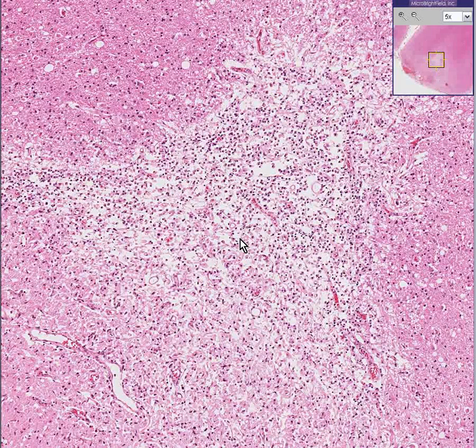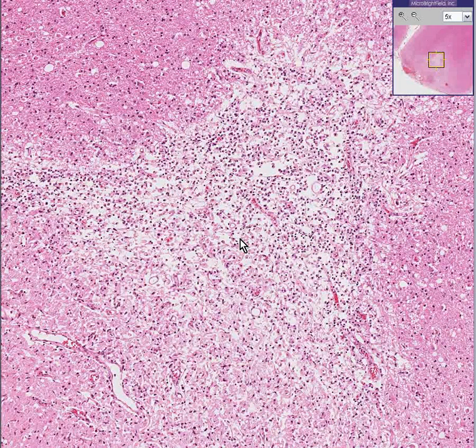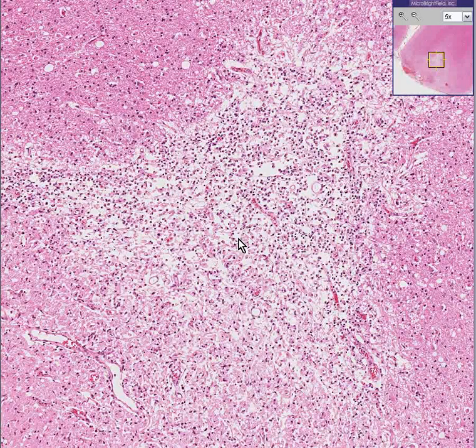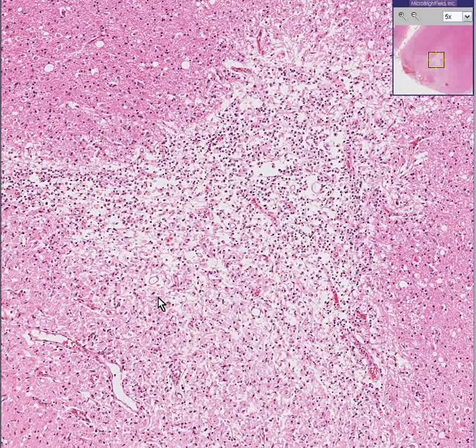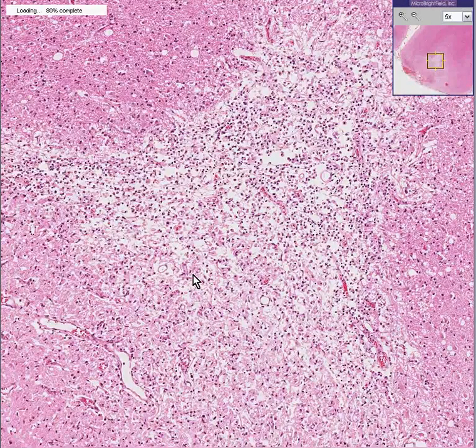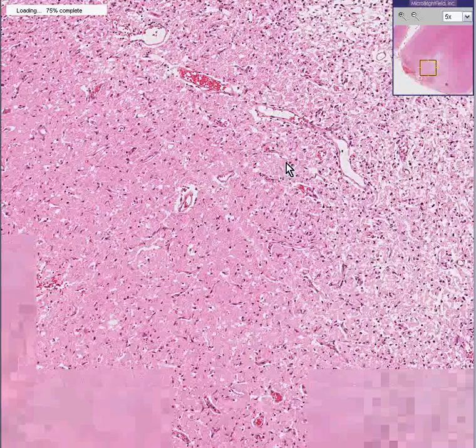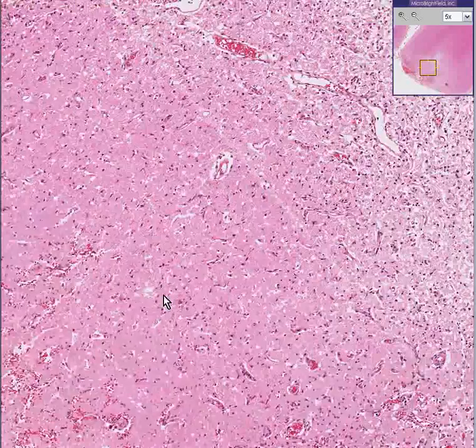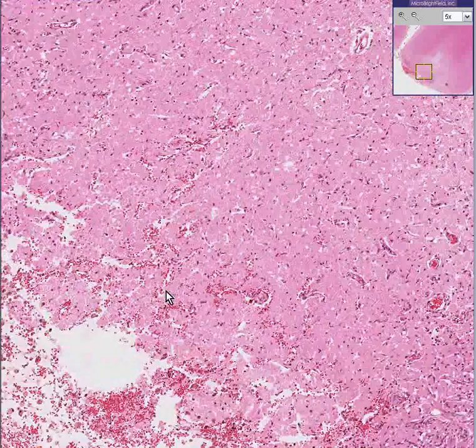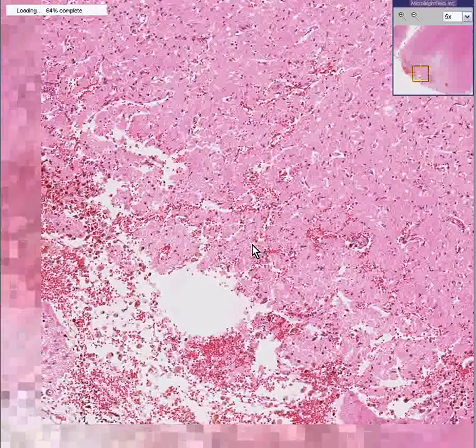Edema, demyelination, and gliosis all go hand in hand non-specifically with just about any type of brain damage. In addition, if the contusion is strong enough, you will see hemorrhage as well, like we are seeing here.